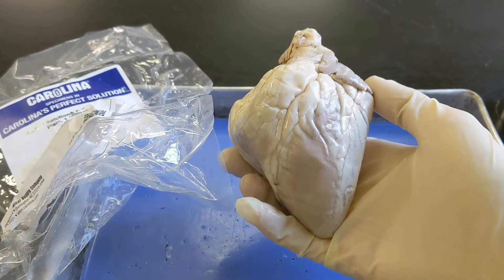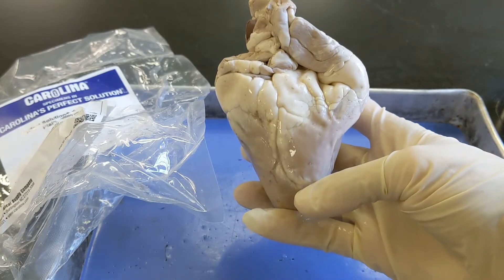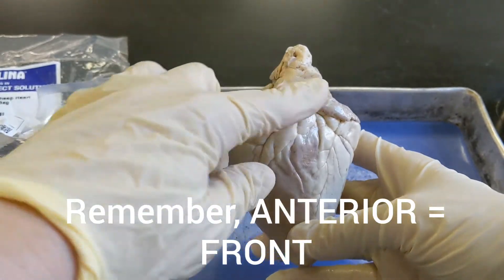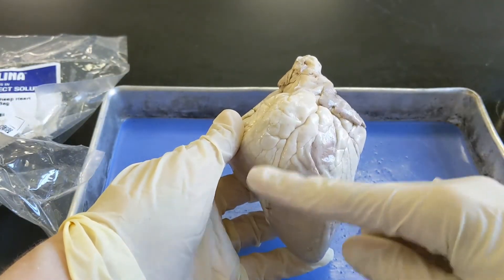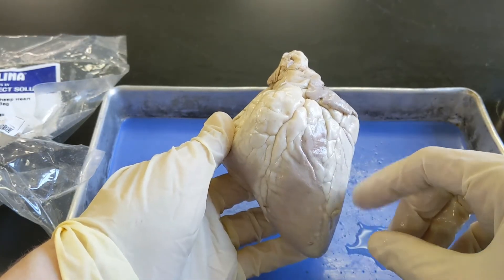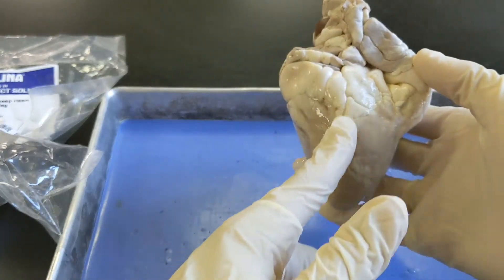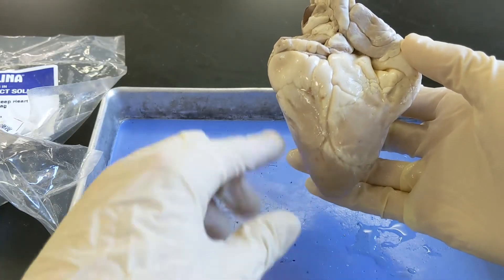Do you think this is the anterior front portion, or this? If you said this is the anterior portion, you are correct. The way I know that is it comes up higher in the front and sort of dips down in the back. Also, the coronary arteries crisscross from right to left across the front, and the apex points slightly to the right when looking at the front. Whereas from the back, you just have a major coronary artery splitting it down the middle, it comes down lower, and the apex points more toward the left.